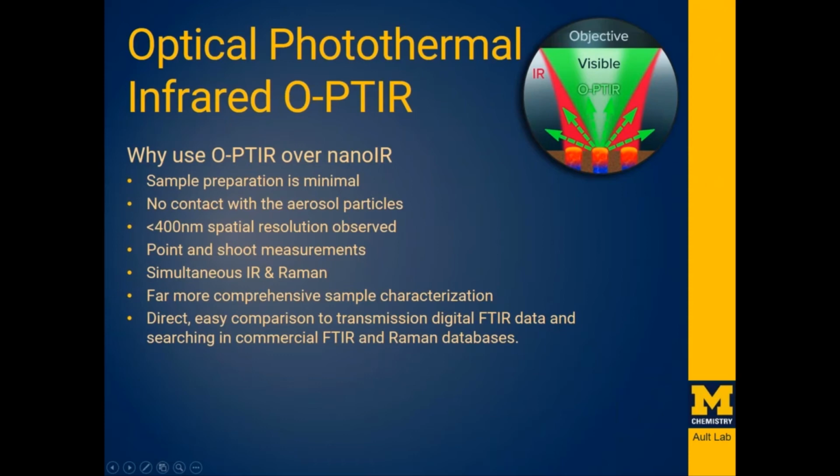It was tough to get really nice mapping sometimes. The lack of contact was great. The fact we could put any substrate in there for the most part, and I'll show in a few slides that we tested a bunch out in that analytical chemistry paper.